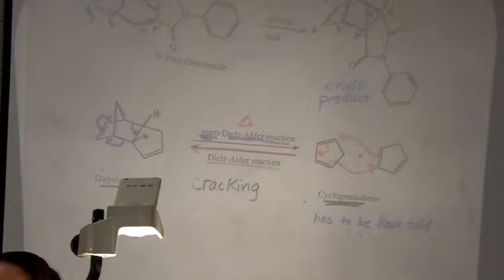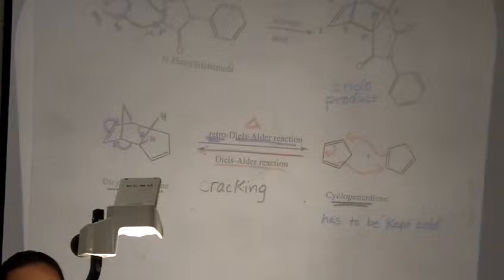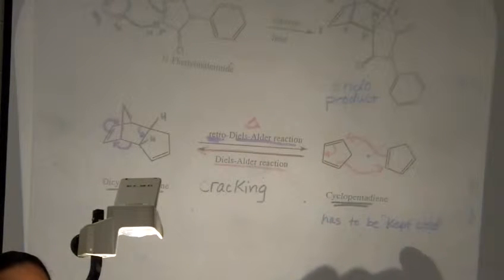And so this, being that it doesn't hang out very long, it has to be cracked right before you use it, and then we keep it really cold so it doesn't want to go back to dicyclopentadiene, okay? So right before lab this week, we'll be doing this. We'll be cracking it, and then you will get the cyclopentadiene from your lab prof because they'll be keeping it nice and cold for you until it's time for you to use it.